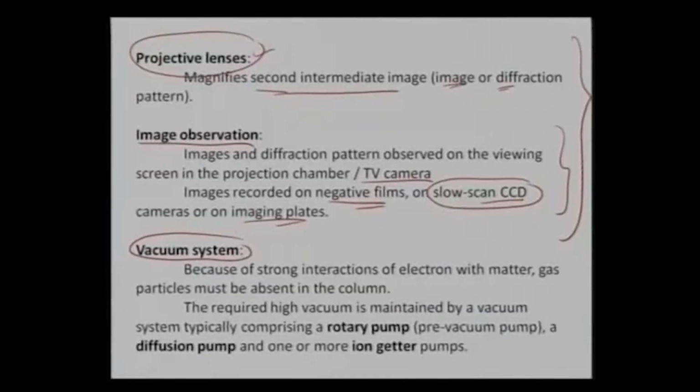So the traveling of the electron is highly necessary, and that can happen because I am looking to achieve information from elastically scattered electrons. So I need to avoid any interaction of the electron with the atmosphere. For that I definitely need something called a vacuum system, because I want the electrons to pass through the beam channel without interacting with anything else, any of the atmosphere. If it interacts with the atmosphere, it loses its energy, so that will become an inelastic interaction.